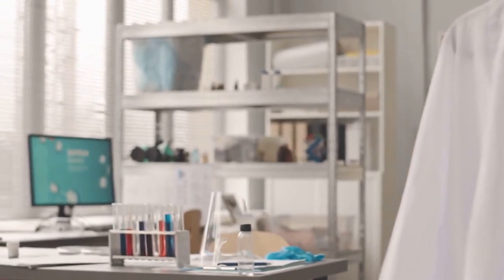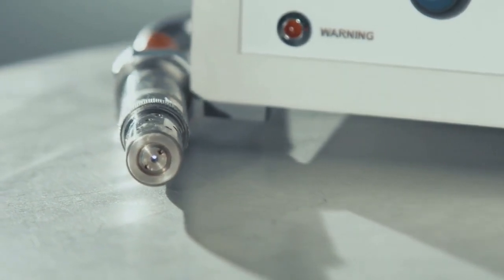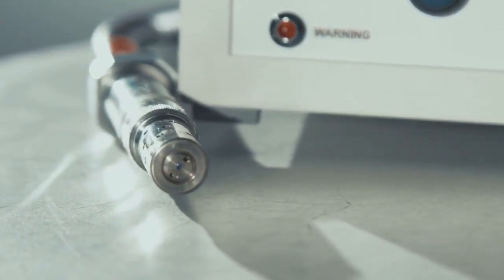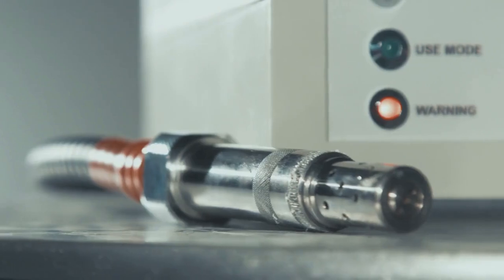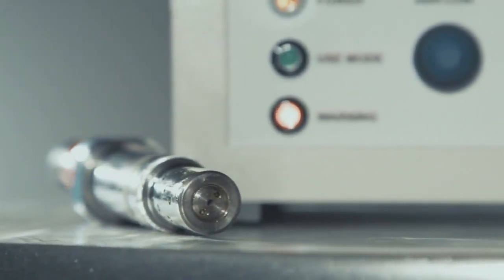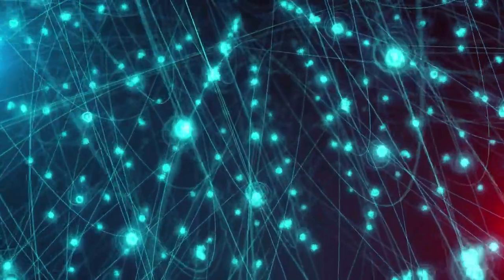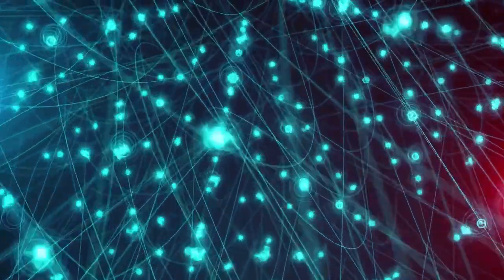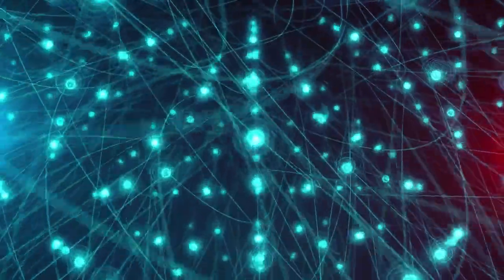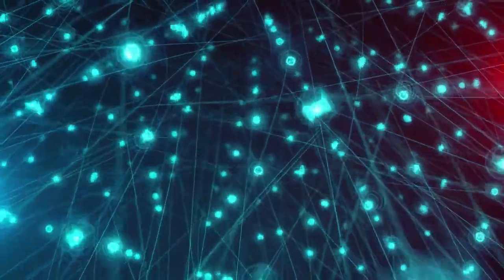Now let's switch to atomic emission spectroscopy, or AES. This method takes a different approach. Instead of just making a cloud of atoms, we use a much hotter energy source, like an electrical plasma, which is way hotter than a typical flame. This intense heat doesn't just create atoms, it pumps them full of so much energy that they become excited. Atoms don't like to stay in this excited state for long. To calm down, they release that extra energy by giving off light. Crucially, each element gives off its own unique set of colors, like a fingerprint.